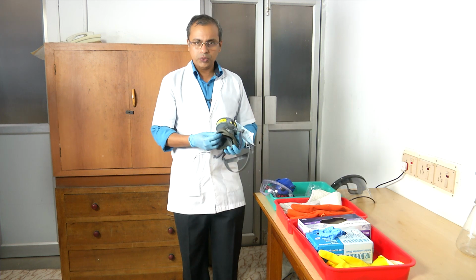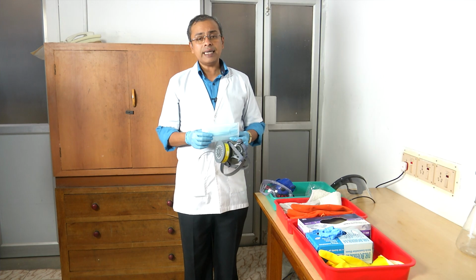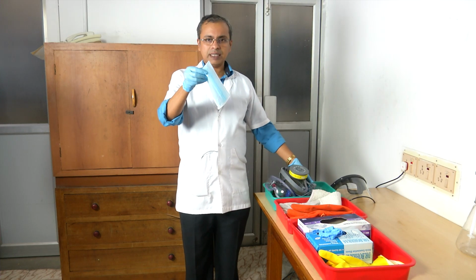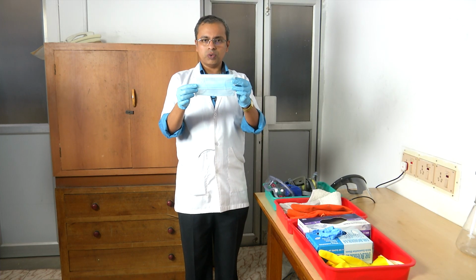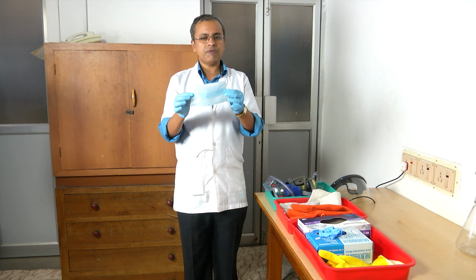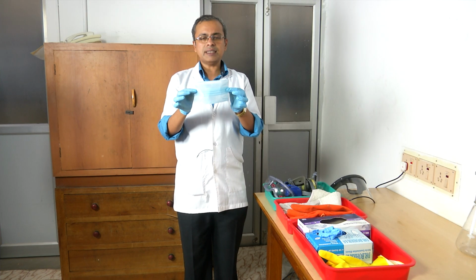Based on the experiments that you are doing, you may also need to protect yourself from dust. Dust is something that again depends on the kind of sample you are using, and it also depends on the specification of the sample. So, this is a simple dust mask, a surgical dust mask kind of thing that you can get, which I am pointing out here, and this is easily available in many medical stores or drug stores. But it depends on your experiment. For some particular purposes it may be sufficient, it may be highly ineffective with specific types of samples. So, you need to be very careful whether this is adequate for you or not.